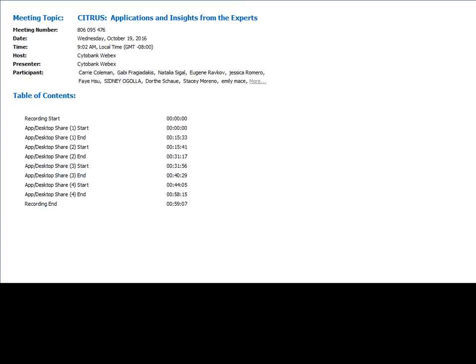And so as I dug in, I learned more about why identifying these populations is hard, and at least a couple of major blocking issues became very apparent to me. First, there were real concrete limits on the number of parameters that you could simultaneously measure in any given cell and experiment, and that means that if you were trying to discover a new biomarker population, you were limited to the number of cellular subsets that you could measure in any given experimental run. And what if the informative signal, what if that population is actually not detectable using that panel of, say, 8 to 10 markers that you selected for your experiment? So that seems to be a pretty big challenge.